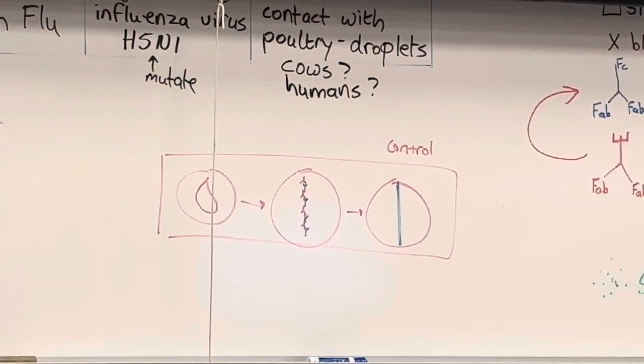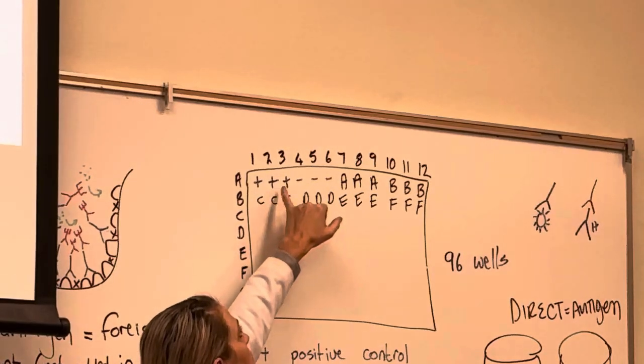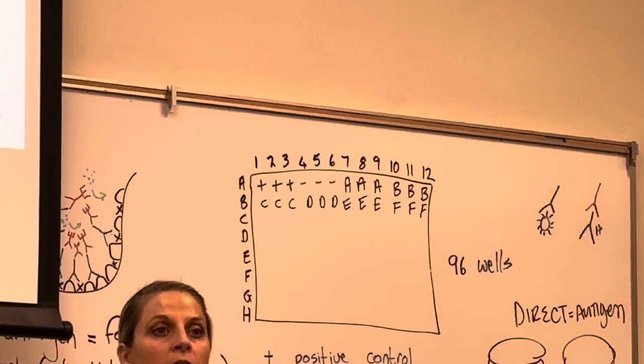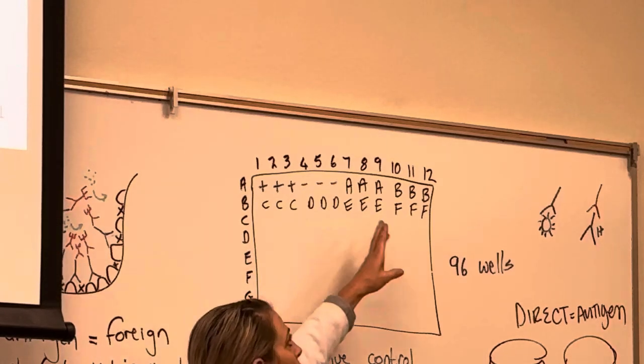So what you're going to do is add... So you have 5 patients, right? Does everybody have 5 patients? You're going to make some assumptions about those patients in the questions. Oh, you have 6. We have 6 now. 1, 2, 4, 5, 6. Okay, cool. So here you're going to add in your little plates. It'll have little pluses. So you add the plus fluid, minus fluid, A fluid, B fluid, and so on all the way down. Those are simulated samples from each patient. So you have 6 patients, and you're testing those wells of 6 patients.